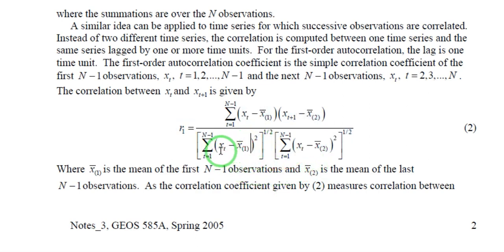So it will give us xt to the power of 4, and because of this square root that we have here, it will give us the xt to the power of 2. So here in the denominator we had the xt to the power of 2, and here again we have the xt to the power of 2, and it will give us finally the R1 with the final value of 1.